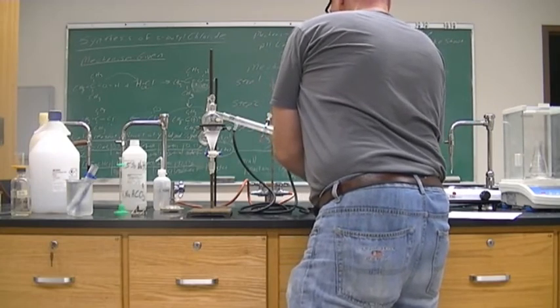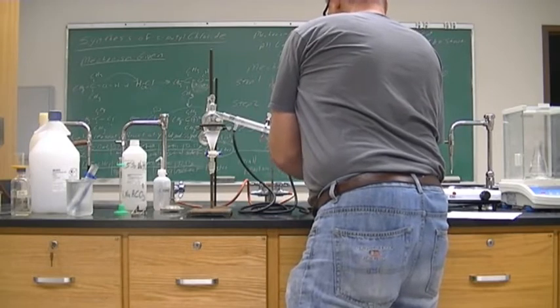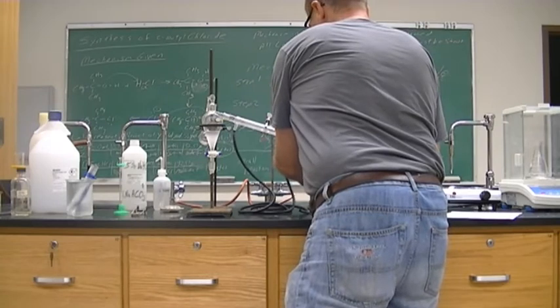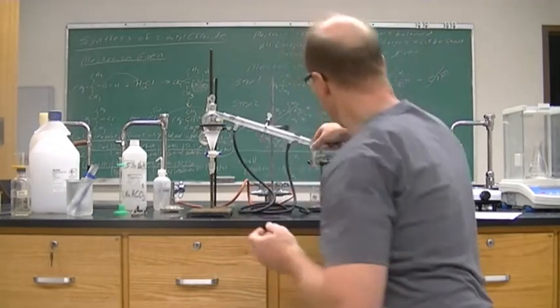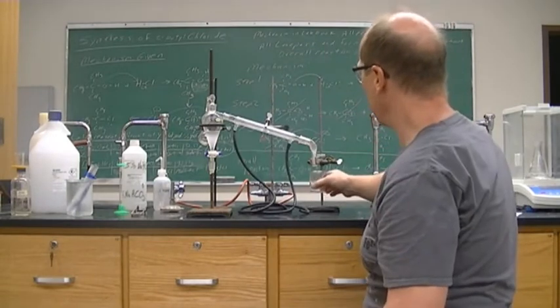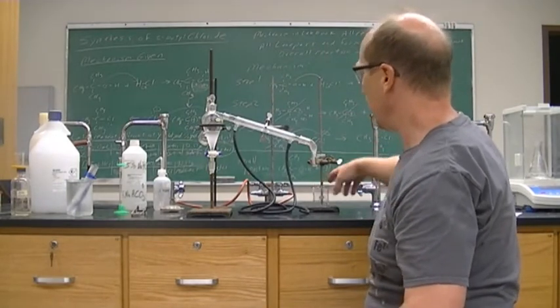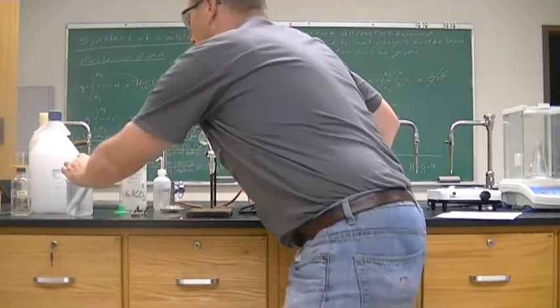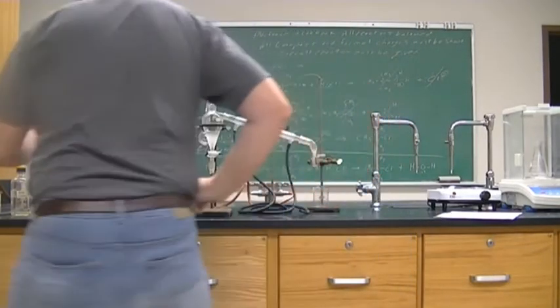All right, so I'm just going to secure this in case it falls out for some reason. It shouldn't, but it might. And so this will then catch it. So if that happens to fall, it will catch it. Now, I wanted to collect it in this beaker here. Now again, I don't want the vapors to escape, and so what I'm going to do is take my ice cool bath here.